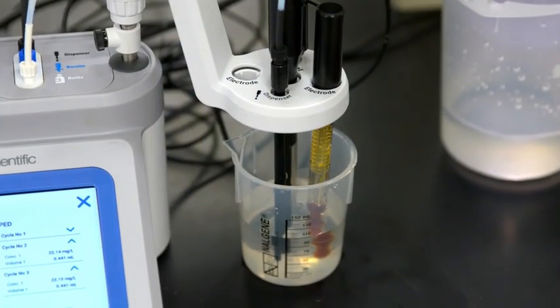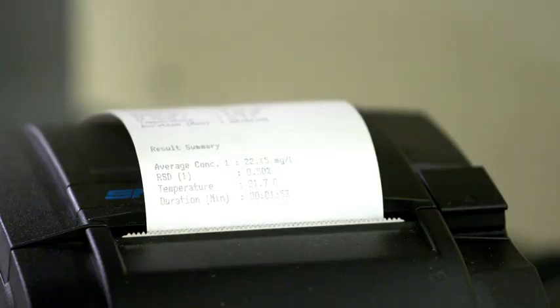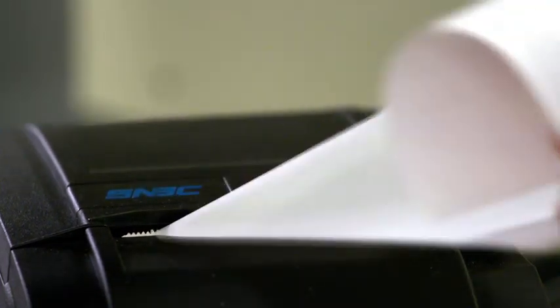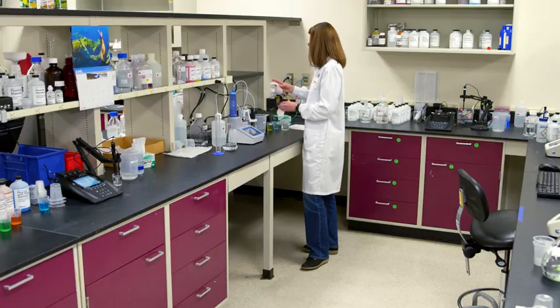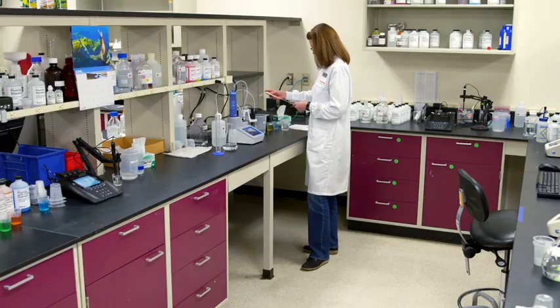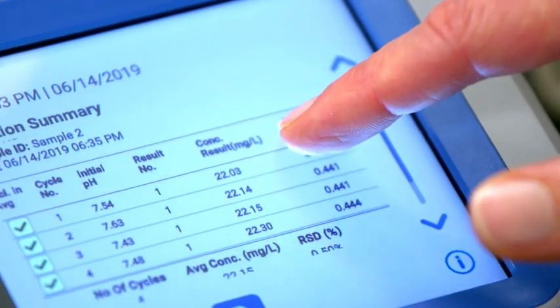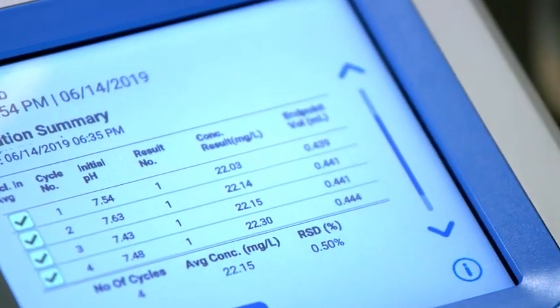We decided to run more cycles. Now let's look at the average results. The results look good, so we can complete the testing.